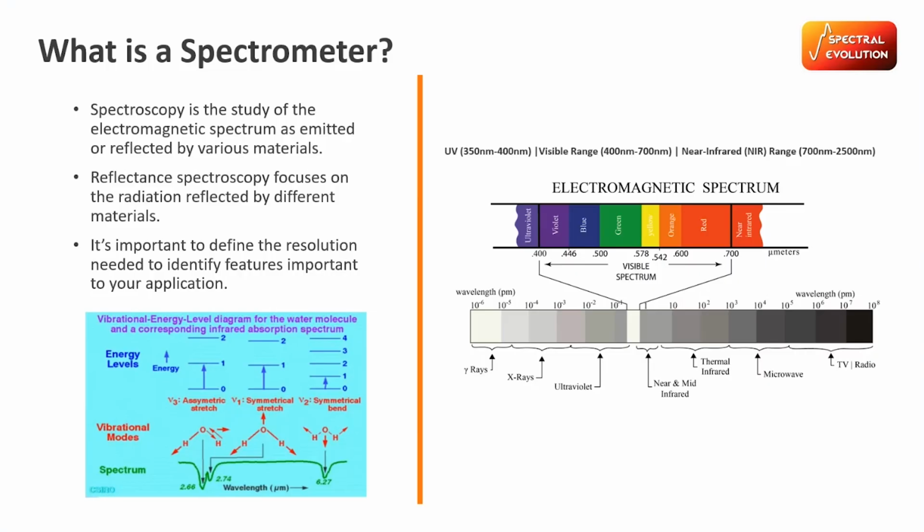Our spectrometers typically have a range of 350 to 2500 nanometers, as mentioned before. So that's targeting the UV-VIS, the NIR, and the SWIR range. So this kind of reflectance measurement is primarily targeting all sorts of different materials, and we're able to identify those materials based on the absorption features. So those absorption features can tell us about the chemical bonds that are present and the chemical structures.